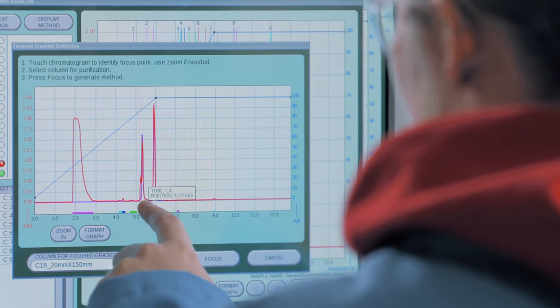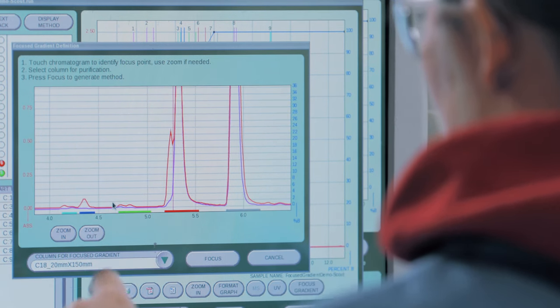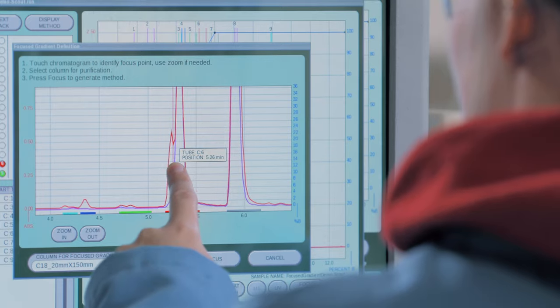That opens a second screen, again showing the peaks of the run. Select the peak that you want to purify. To make that easier, you can zoom in on the chosen peak.